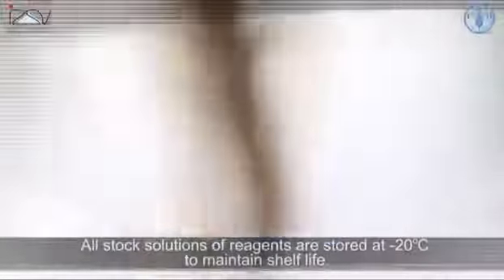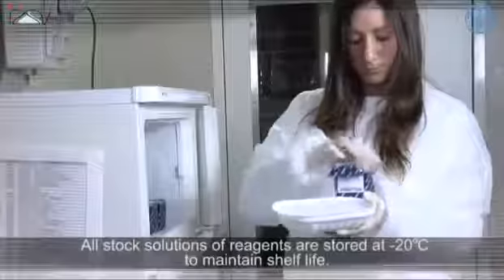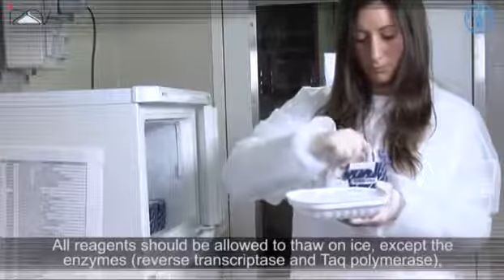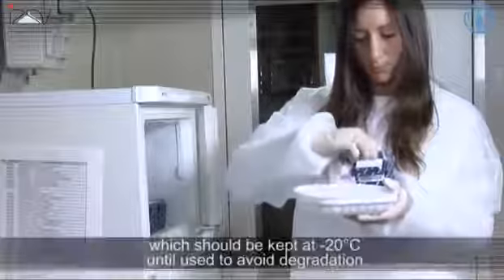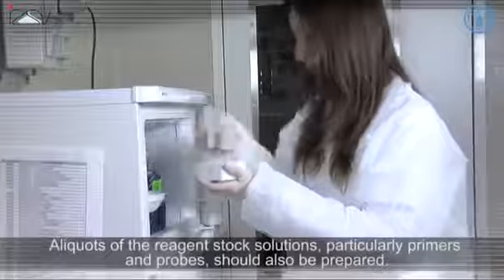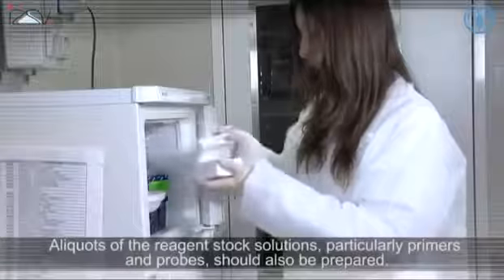A devoted refrigerator should be present inside the mix room for the storage of molecular reagents. All stock solutions of reagents are stored at minus 20 degrees Celsius to maintain shelf life. All reagents should be allowed to thaw on ice, except the enzymes reverse transcriptase and Taq polymerase, which should be kept at minus 20 degrees Celsius until used to avoid degradation. Aliquots of the reagent stock solutions, particularly the primers and probes, should also be prepared.